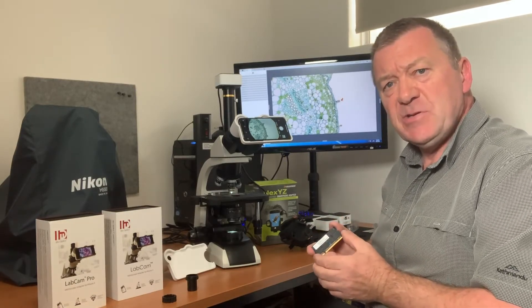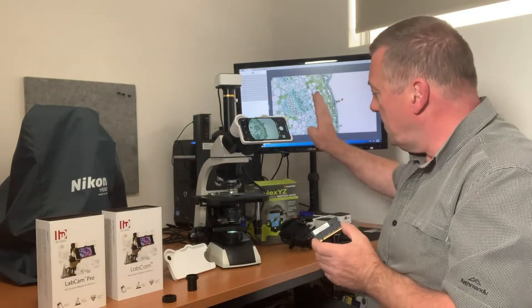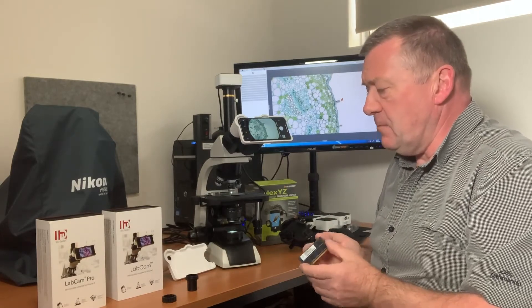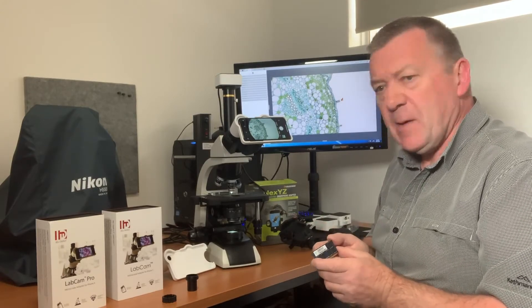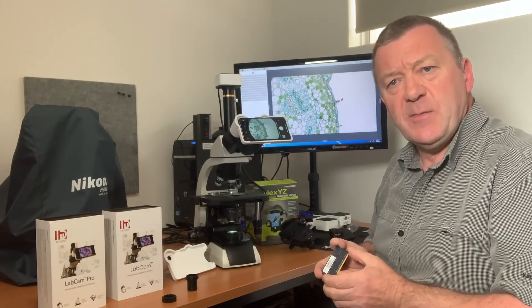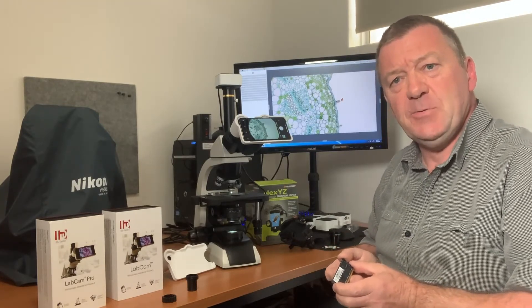We've got over 40 sample images on our website — comparison images using the camera, the Celestron, and both the LabCam adapters — showing what each specimen looks like with each adapter and the microscope camera. Please take a look for yourself and see what you think about the comparisons at microscopes.com.au.